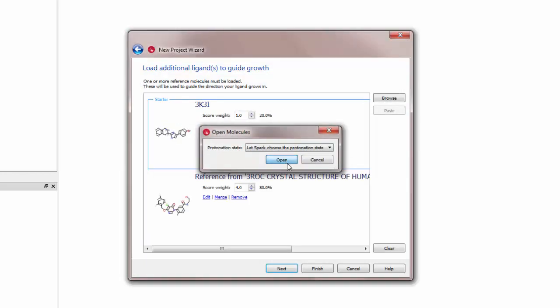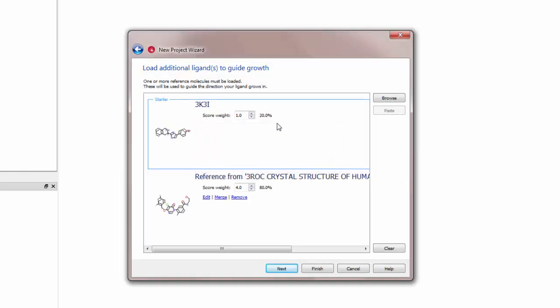In the panel notice that the weightings for the ligands are different. The starter ligand contributes 20% to the score while the ligand I'm growing onto gets 80% of the consideration.